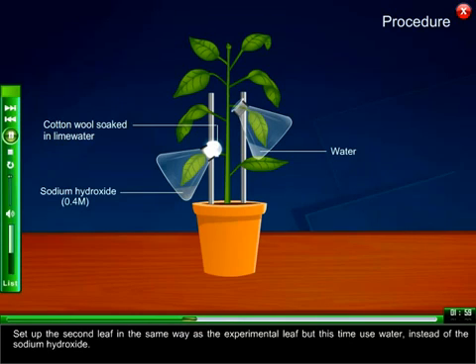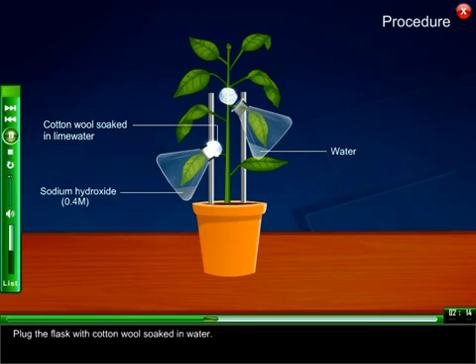Set up the second leaf in the same way as the experimental leaf, but this time use water instead of sodium hydroxide. Plug the flask with cotton wool soaked in water.